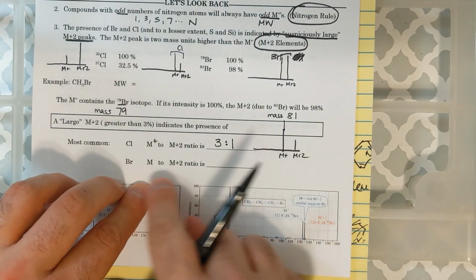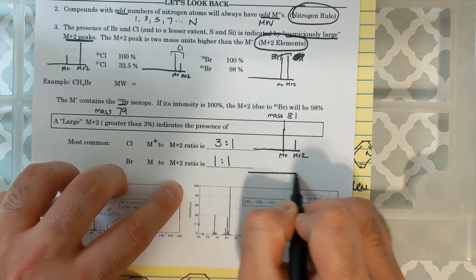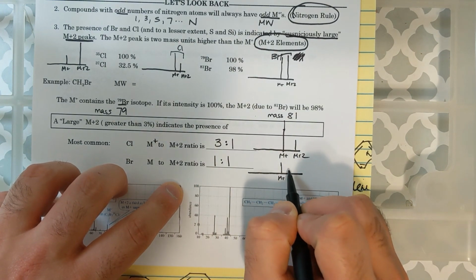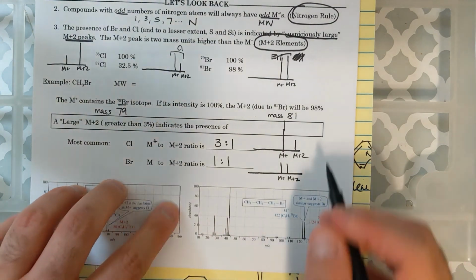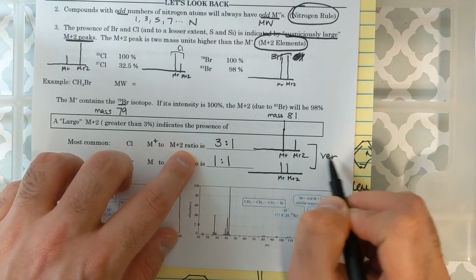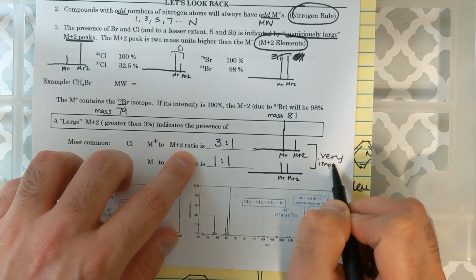And then for bromine, the M to M plus 2 peak is going to be about 1 to 1 in height. So if I have M plus, my M plus 2 peak is going to be about the same size. This is very important.